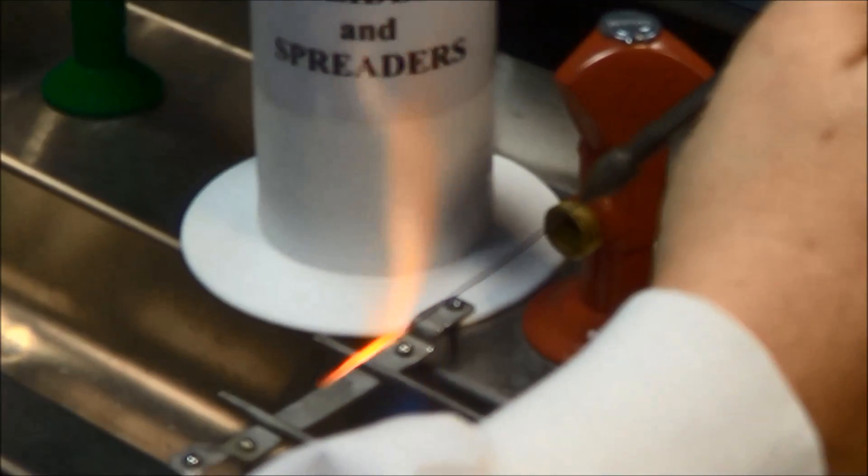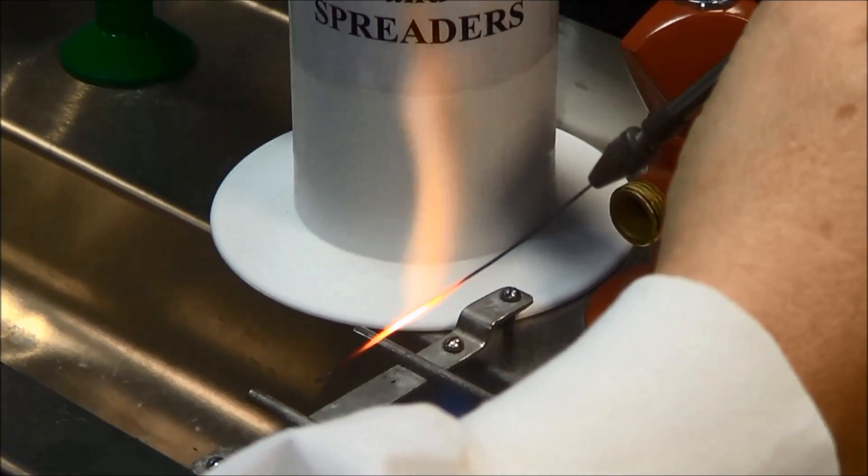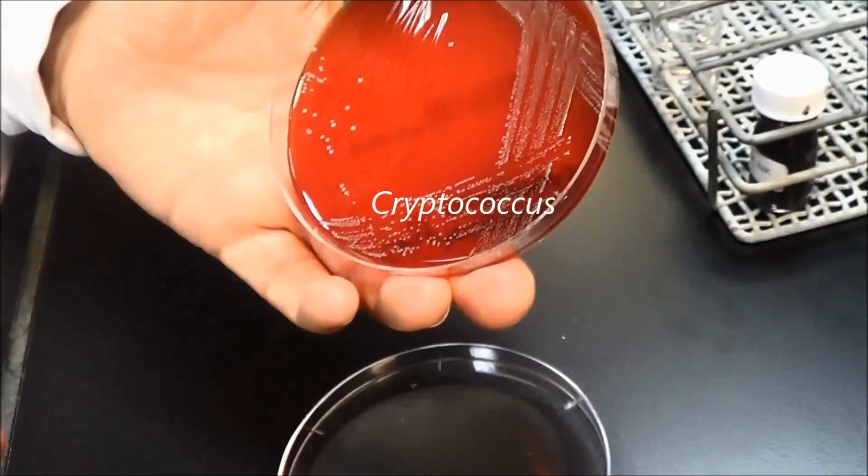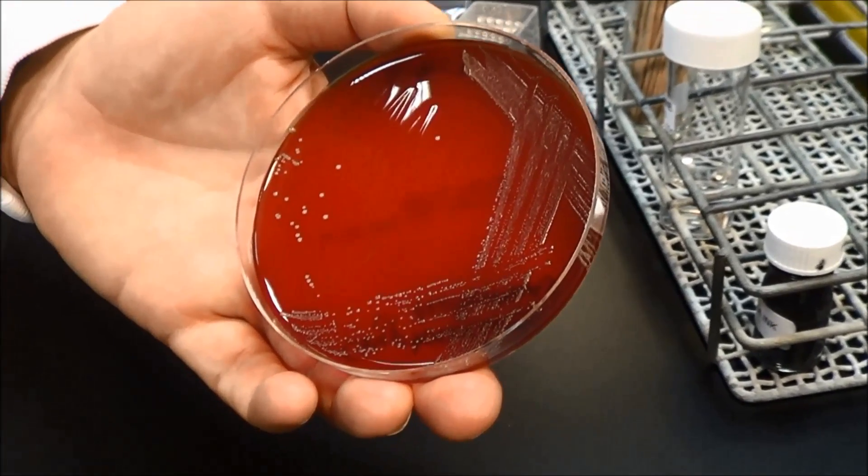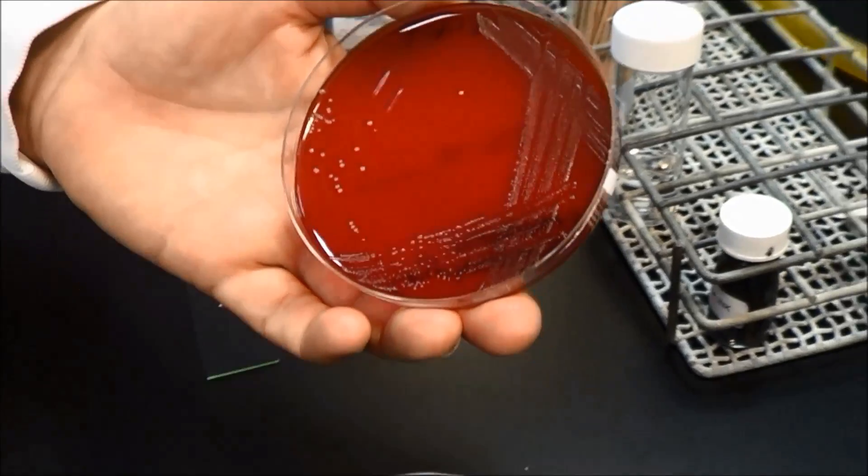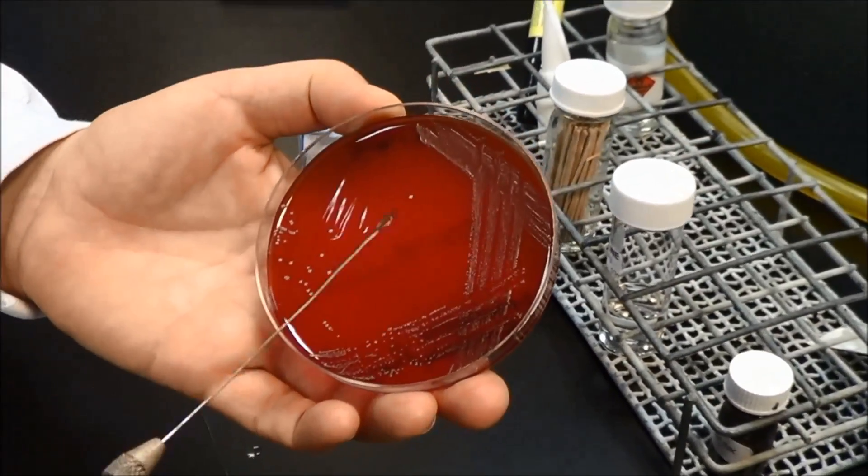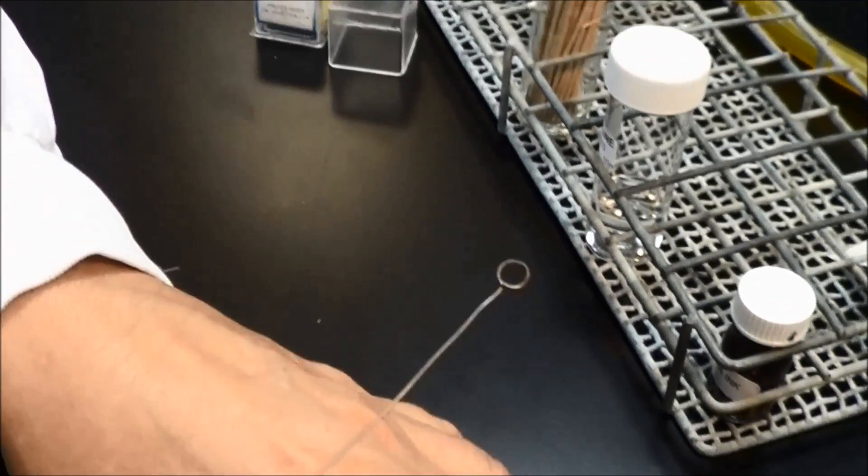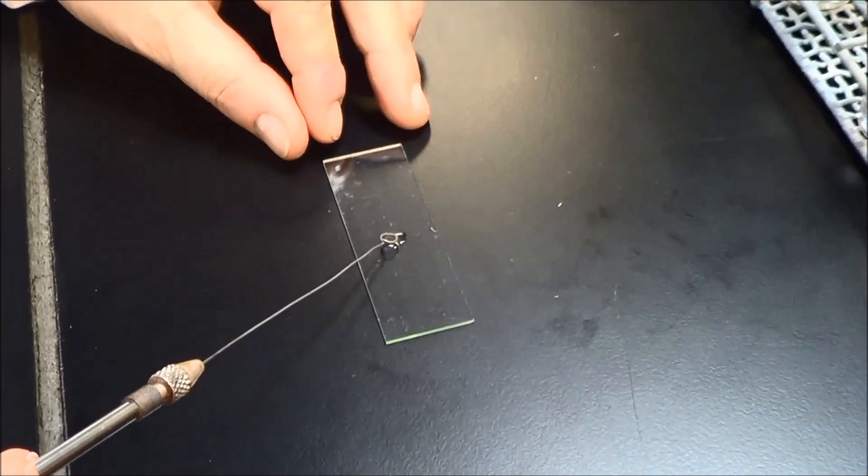Re-sterilize the loop. Take a small amount of growth from a well-isolated colony on a blood agar plate. Make a light suspension by emulsifying the yeast in the saline. To the naked eye, the suspension should be barely visible as cloudiness.